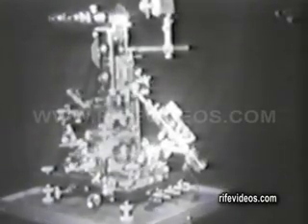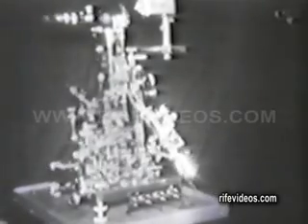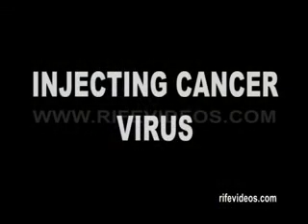A virus microscope was a prismatic instrument. And this is a number 3 universal microscope, prismatic type, that embodied all fields of microscopy, including dark field, polarized light, infrared light, ultraviolet light, and monochromatic beam light. The indicator dial moved around 7 times to move the object up and down 1 micron, and it was a very sensitive instrument. The ocular that you see on the left side in the middle of the instrument, when plugged in, made it a standard microscope.